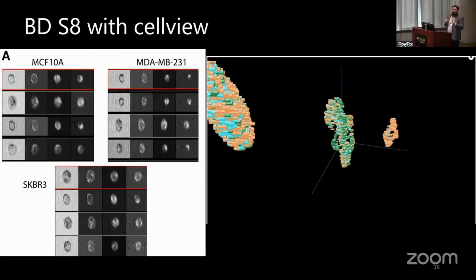So I did the holdout. I first started with just the bright field. Bright field was like 23% accuracy. And then incorporating each one, you did get more. The highest increases were the side scatter and the mitochondria. And then it would be certain things such as image moments. Shape is going to be a bit homogeneous because you're putting them in suspension, so we need to go beyond that.